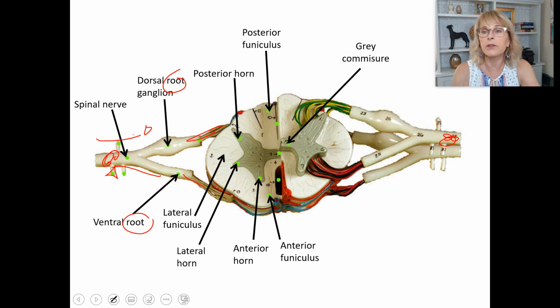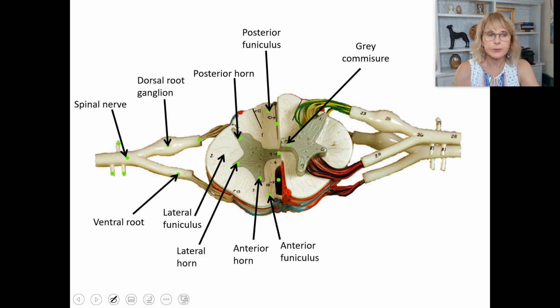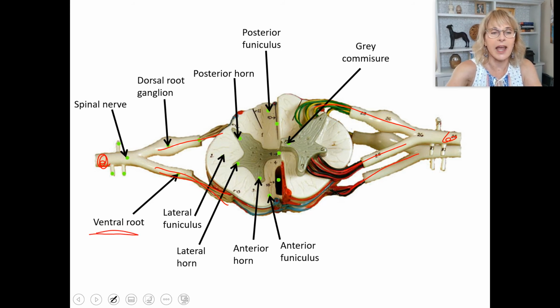I will only find either information going inward or information going outward. So this area where everyone comes together is called the nerve. This area, here or here or here, that is called a nerve root. The one that is anterior is properly termed the ventral root. I apologize, it wasn't my fault. And this one here is called the dorsal root.